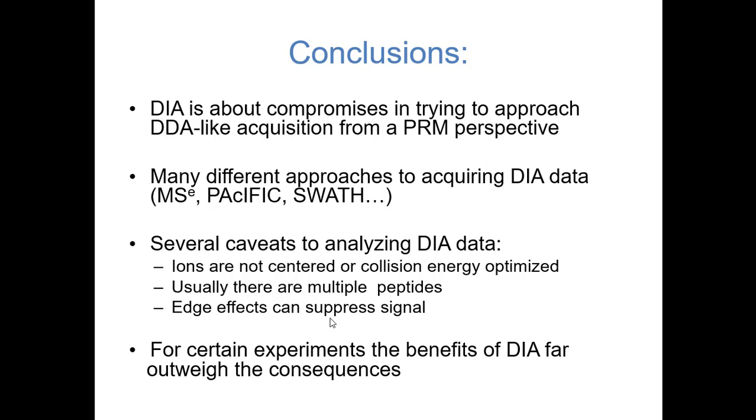It basically is pretty limited in terms of the amount of measurements that you can make in any given experiment. Consequently, one of the things you have to do with that experiment is pretty heavy chemical fractionation, like a resin-based fractionation or something like that. So you have to do SCX or MCX or something like that, high pH reverse phase, to collect 10, 12, 24 fractions and then run each of those individually.